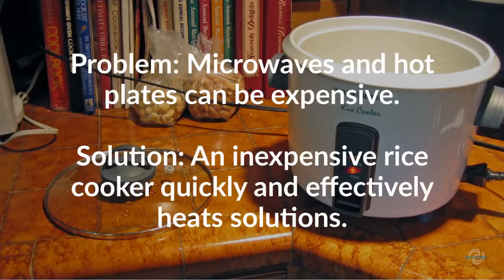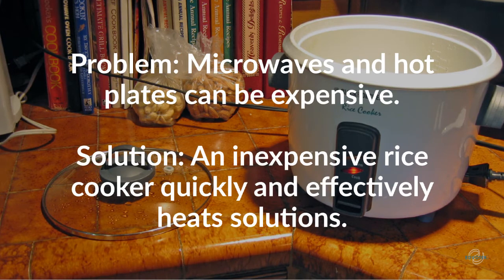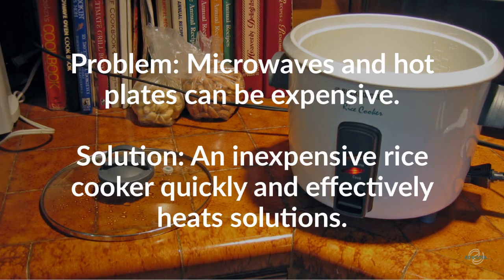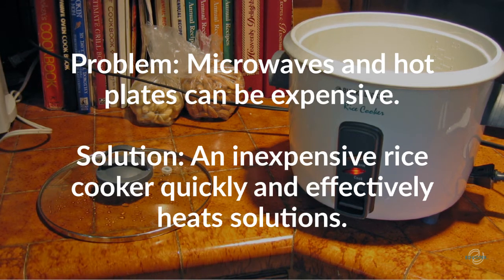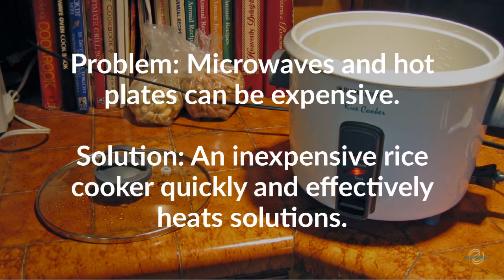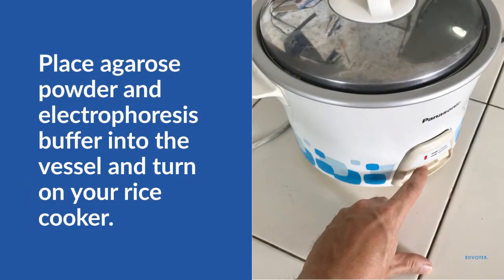So how do we heat the powdered agarose solution to boiling? We can use a microwave or a stirring hot plate, but they can be costly and can cause the agarose solution to boil over and create a mess. Stretch your lab budget with an easy, inexpensive alternative: a rice cooker. Small personal rice cookers can be purchased from most retailers for around $15. Rice cookers use electricity to heat their contents to high temperatures, perfect for melting agarose.